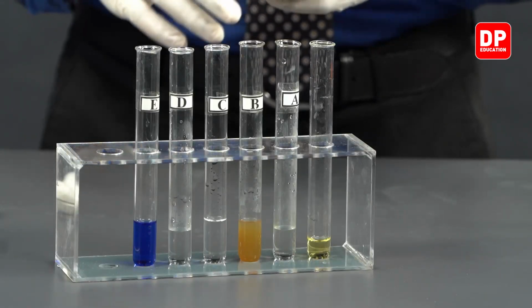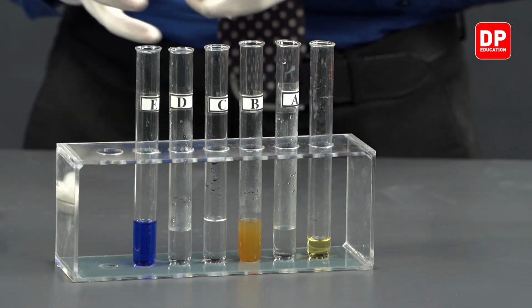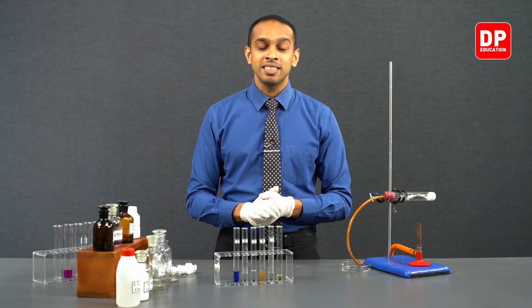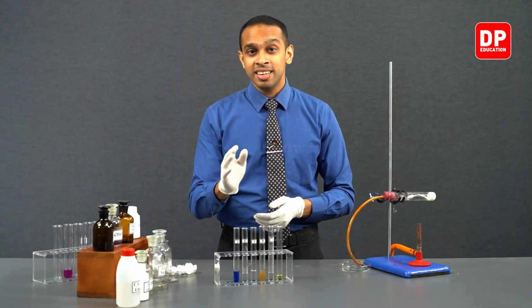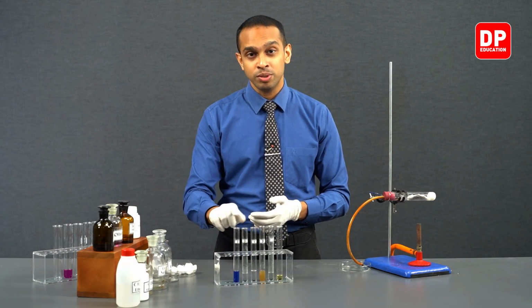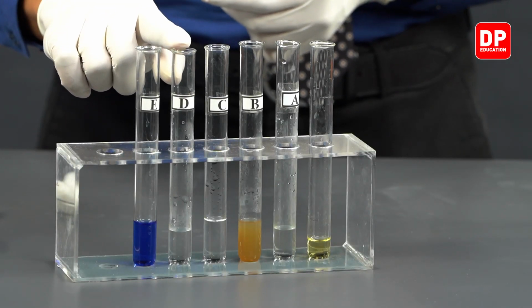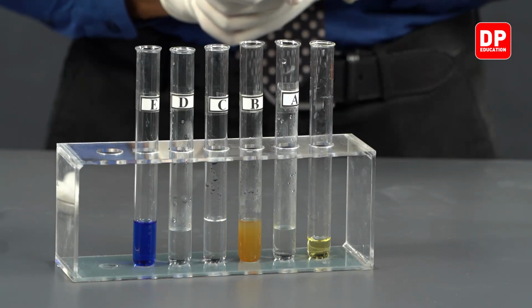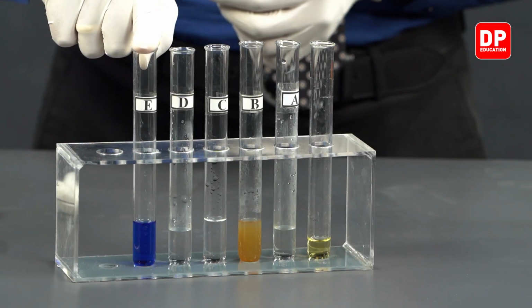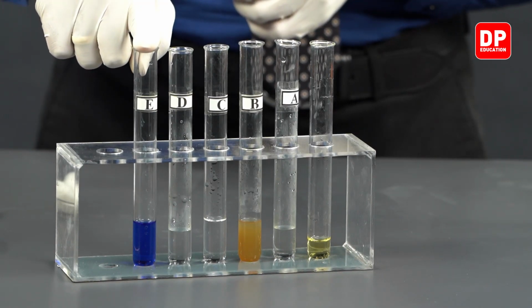Alkynes can react with ammoniacal silver nitrate or ammoniacal cuprous chloride to form metal acetylides. However, alkenes will not show this reaction. Therefore, we do not observe any color change when you are reacting ethene gas with ammoniacal silver nitrate or ammoniacal cuprous chloride.